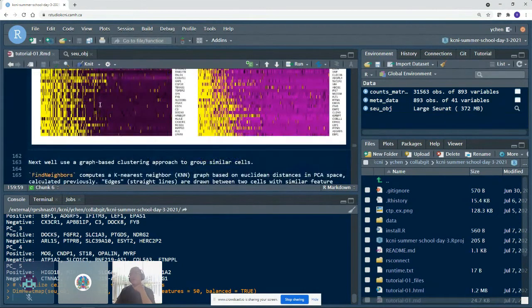So that is about where we will go for principal component analysis. And Keon will be going through principal component analysis as part of our cell type deconvolution, our method for estimating cell types from bulk RNA-seq data, in the next tutorial as well.